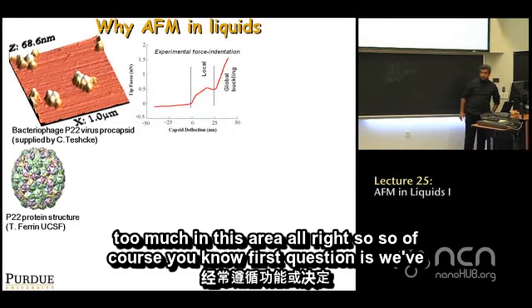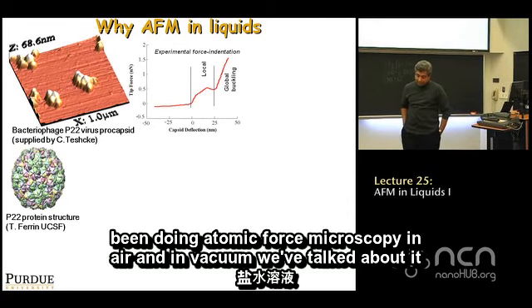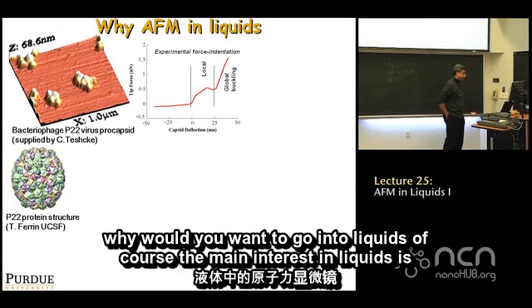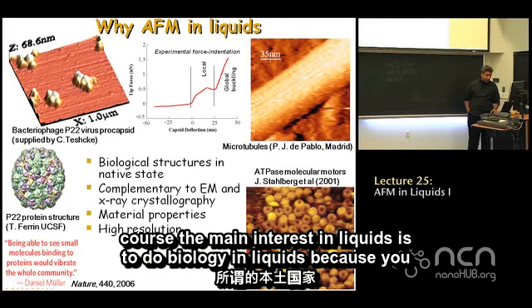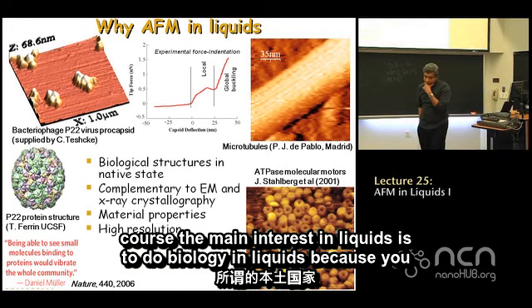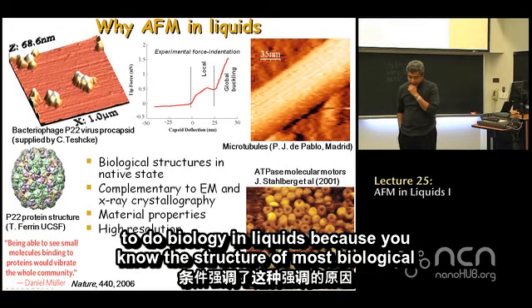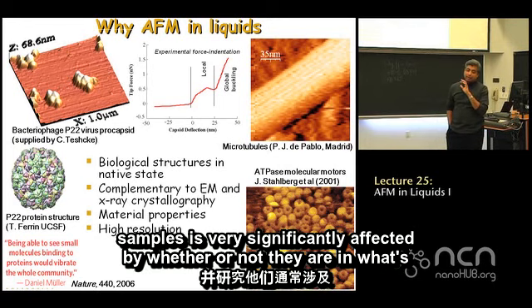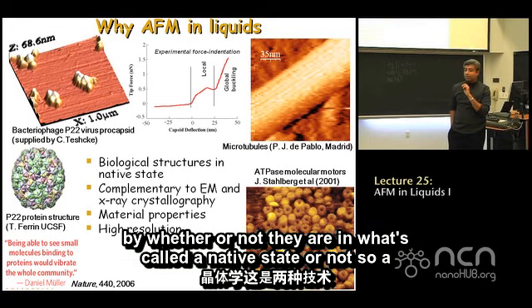Of course, the first question is, we've been doing atomic force microscopy in air and in vacuum. We've talked about it. Why would you want to go into liquids? Of course, the main interest in liquids is to do biology in liquids, because the structure of most biological samples is very significantly affected by whether or not they are in what's called a native state or not.